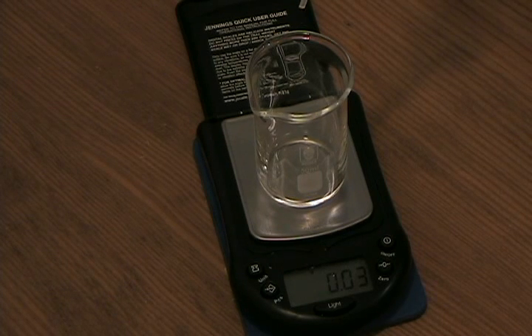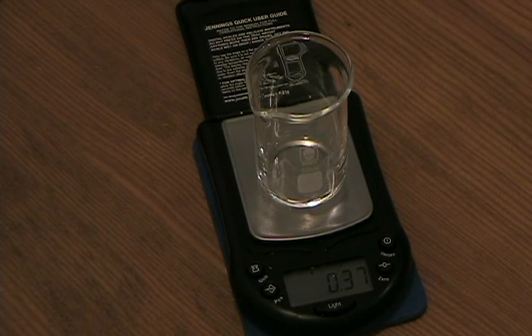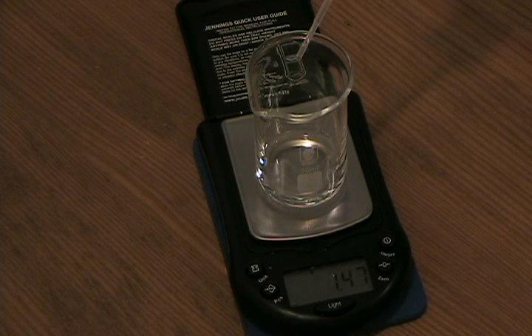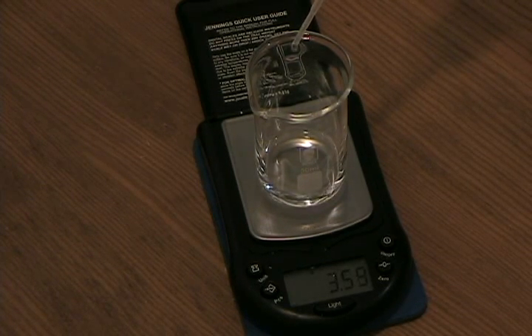Counting drops: 1, 2, 3, 4, 5, 6, 7, 8, 9, 10. At 10 drops we have a reading of 0.37 grams, so we'll continue adding water. It's important to maintain consistent drop size, so always keep the pipette at the same angle and try to allow the drop to form fully. Continuing to count... 41, 42, 43... 91, 92, 93, 94... and 100. At 100 drops we show a mass of 3.62 grams, so we can run our calculations on that number.